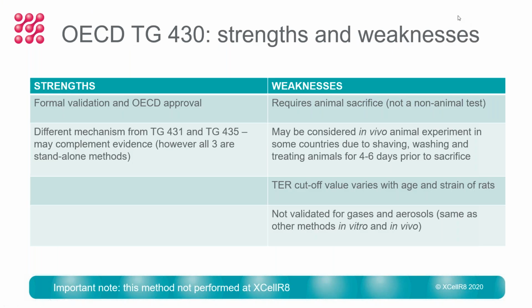So the strengths are it's formally validated, and because it has a different mechanism from the other 2 tests we've talked about, it may be considered to provide complementary evidence. However, it's important to note that the IATA states that all 3 are considered as standalone methods, so you don't necessarily need to do more than one.